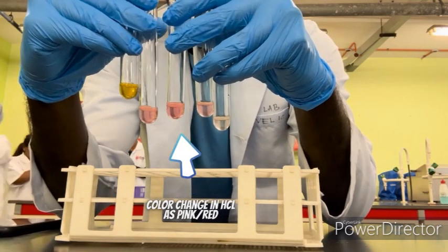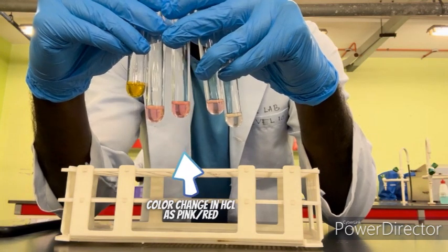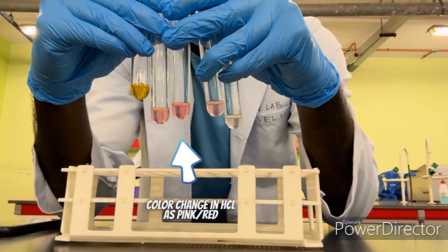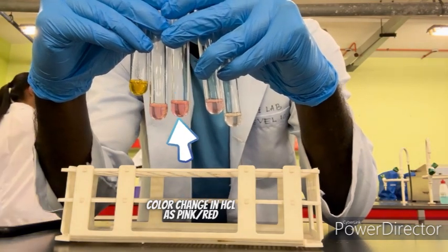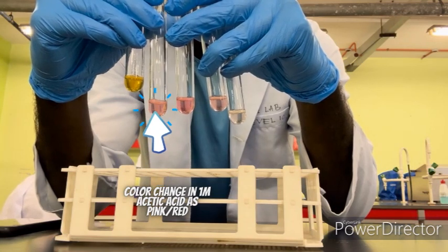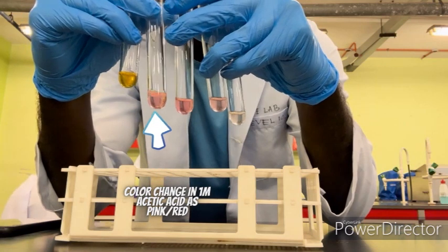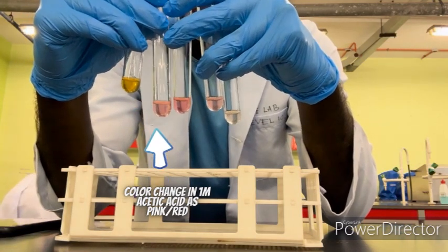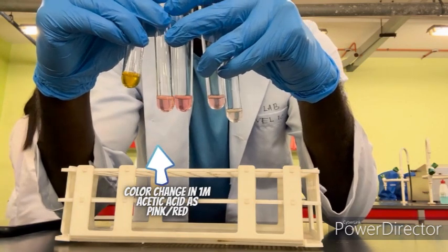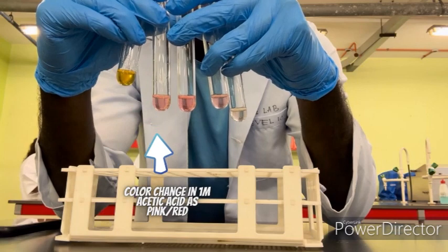And this one, the chemical will be HCl, and it also changes color here to a bit red color or a pink color. Okay, and this one is acetic acid 1m. Okay, we can see there is a color change too. So we can see here for the HCl and for the acetic acid 1m, there's not much difference here. We can see there's almost the same color.